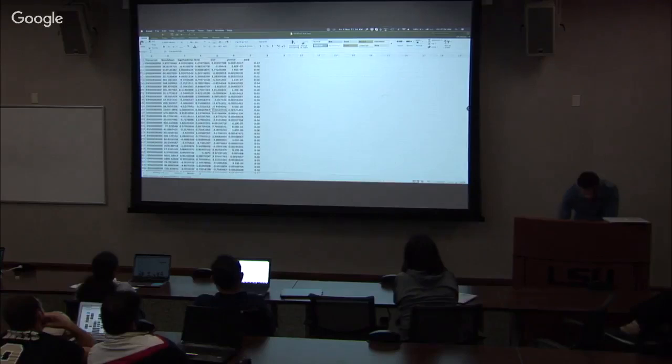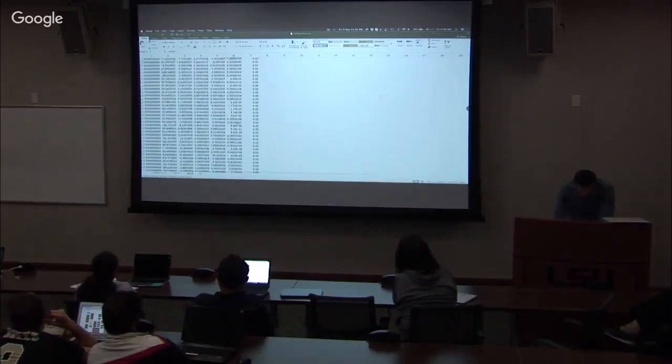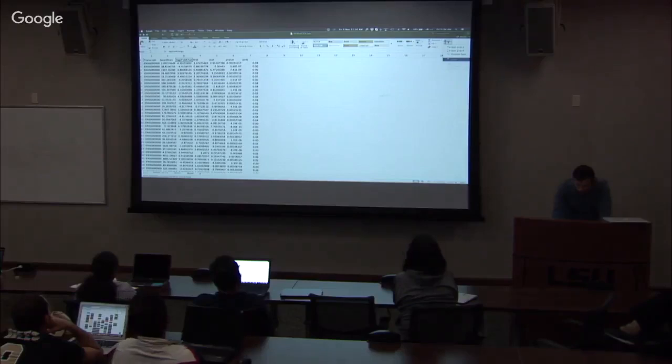So I have a total of 2,250 genes like that. And the second thing that I want to use is log fold change. So I want to, again, filter out the ones that are the most different, right?